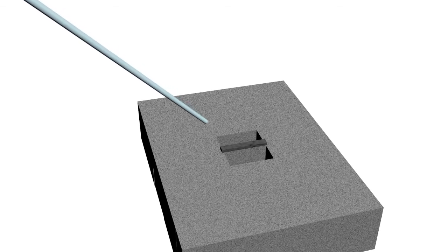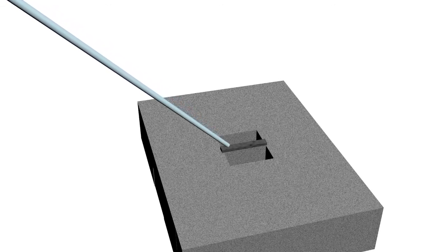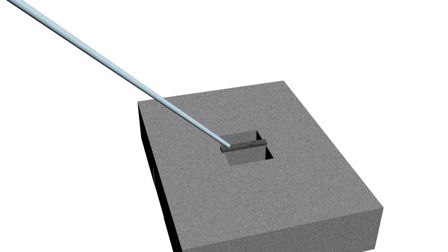Then, the omniprobe's tip is moved into contact with the lamella. The omniprobe is attached to the lamella by depositing platinum on the contact site.